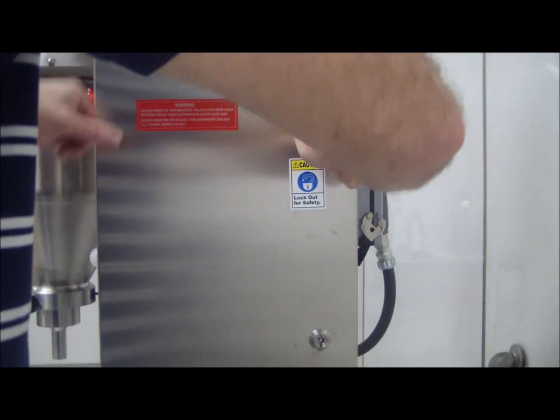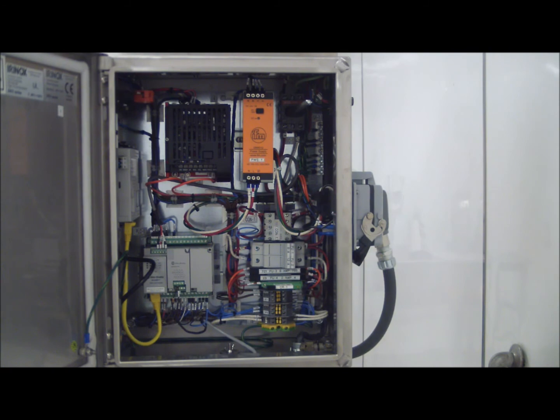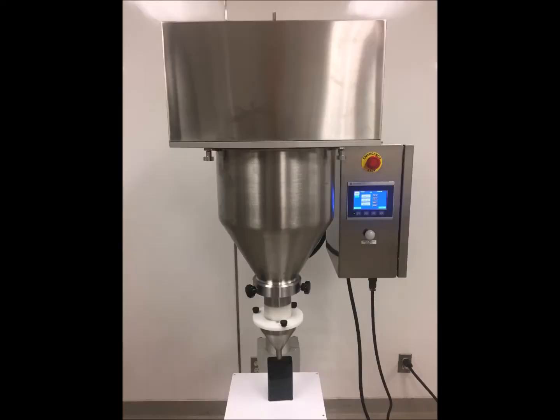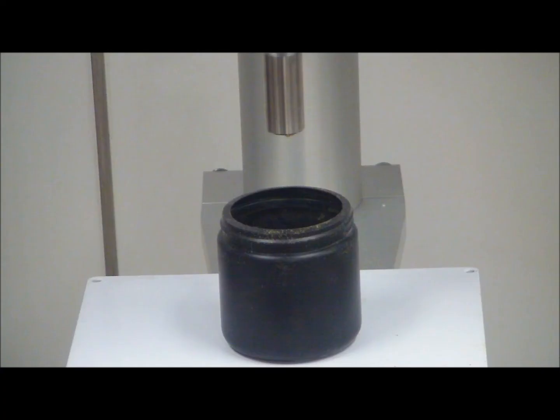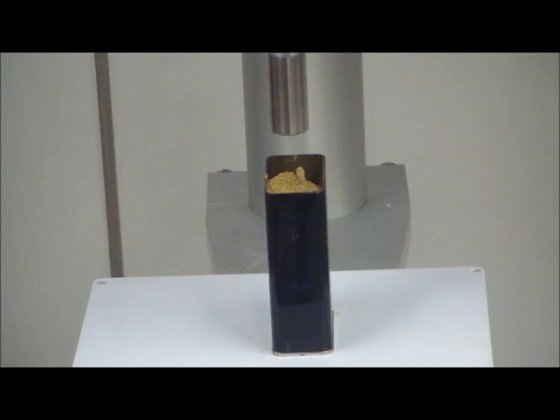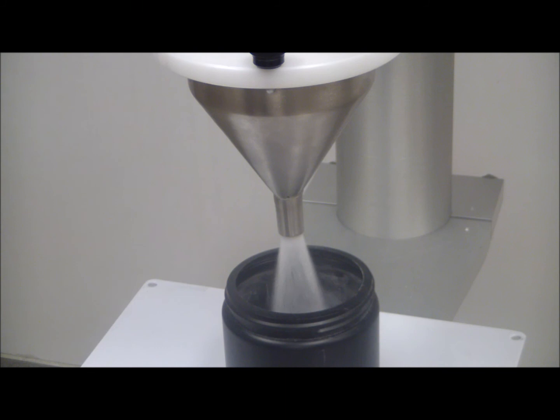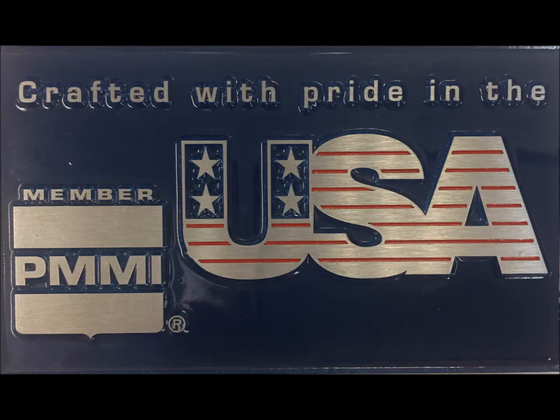The compact NEMA 4X control box protects all your sensitive electronics. And there you have it — the Perfil microfiller. With a 23-year track record, its reliability and performance is unmatched. The microfiller is a great economical solution for small to mid-sized production runs, made with pride in the USA.